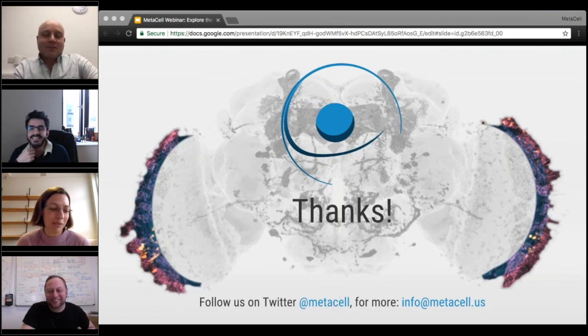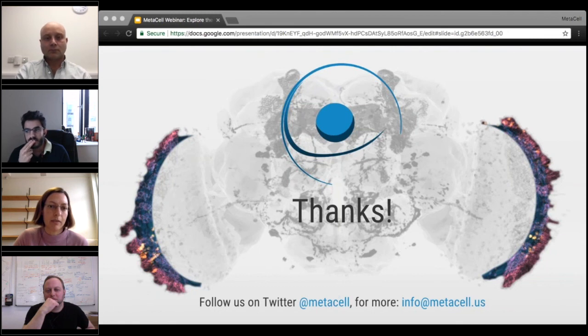So Rob, we're setting up a server to serve that data in terms of the actual EM sections, and that's almost ready, and we will be displaying some data that will be attached to publications coming out of the Connectomics effort through that server.